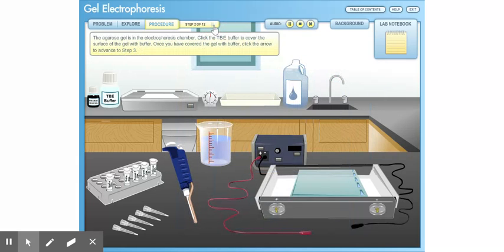The agarose gel is in the electrophoresis chamber. Click the TBE buffer to cover the surface of the gel with buffer. Once you have covered the gel with buffer, click the arrow to advance to Step 3. Click the micro-pipet to load the bromophenol blue dye and mix it with a marker DNA. The mixture is then ejected into the marker DNA well. Once you have filled the marker DNA well, click the arrow to advance to Step 4.